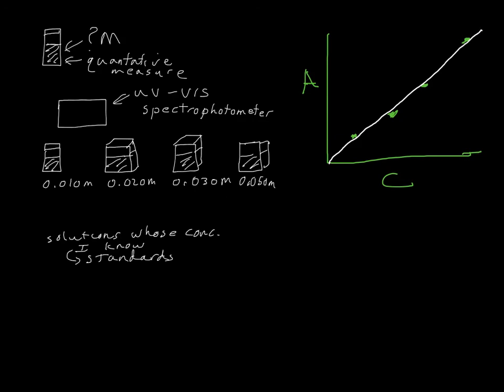If I have a line, I can determine the formula for the line of best fit. This would give me the relationship between absorbance and concentration.